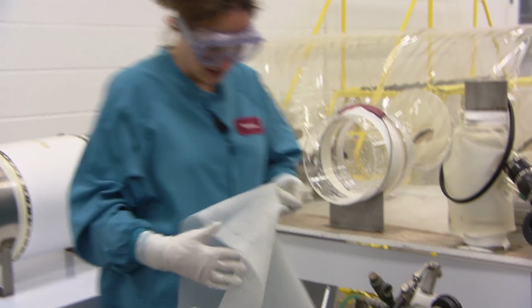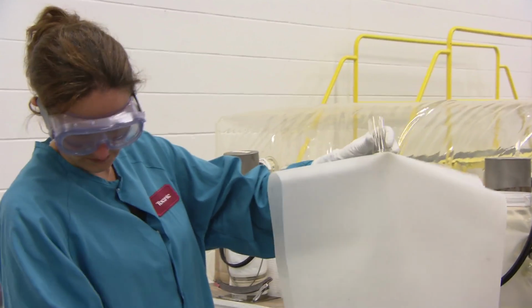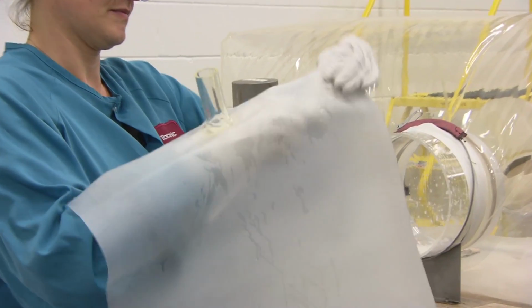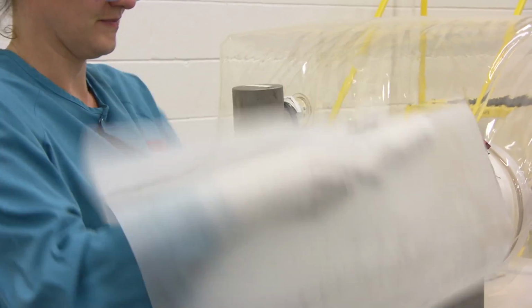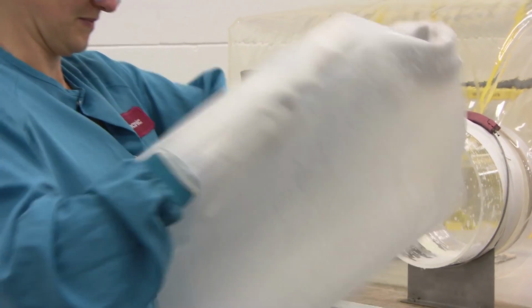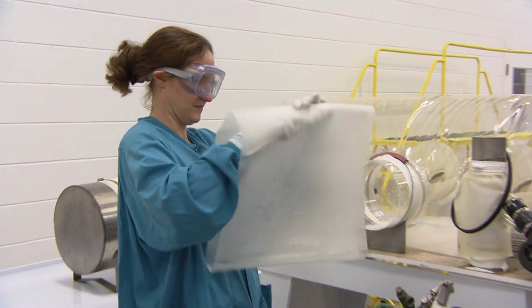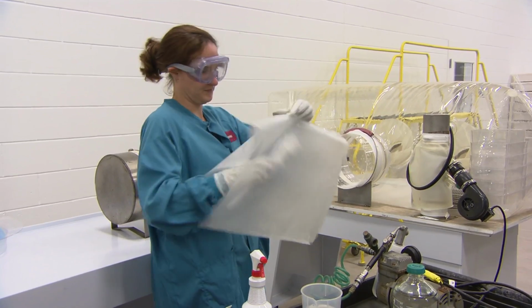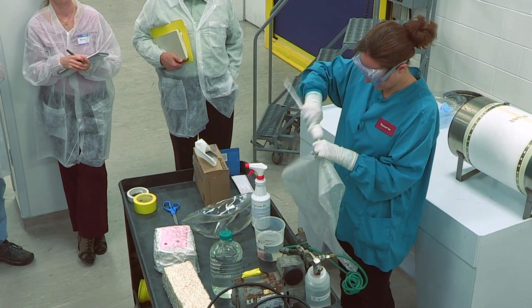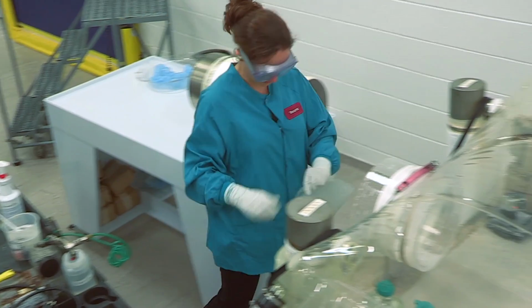Because we're going to be spraying in water, I'm only going to swab half of it. That's just to hopefully keep our sleeves from getting too wet. Swab in our Taconic tube. Okay. We'll place this on our port.